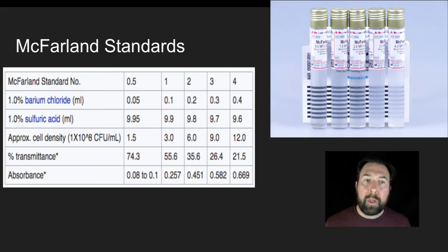Now, what you can use the McFarland Standards for is this gives you a rough estimate of approximately how many cells you have in every milliliter of solution. This does assume that the things that we're looking at are bacterial cells, and that's actually what this is based off of. I realize that some algae are going to be eukaryotic, and so this is an imperfect measurement, but we're going to use this as our assumption that these are photosynthetic algae and that they may be single cellular.